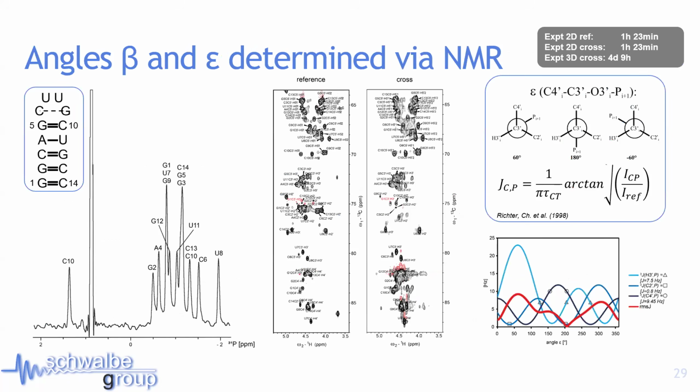The last experiment I will just go over very briefly are the HCP experiments. So they are using the phosphor backbone. And again, here, this is basically a combination you can think of the first and second experiment. So here we extract 3 and 2J couplings based on an intensity approach.